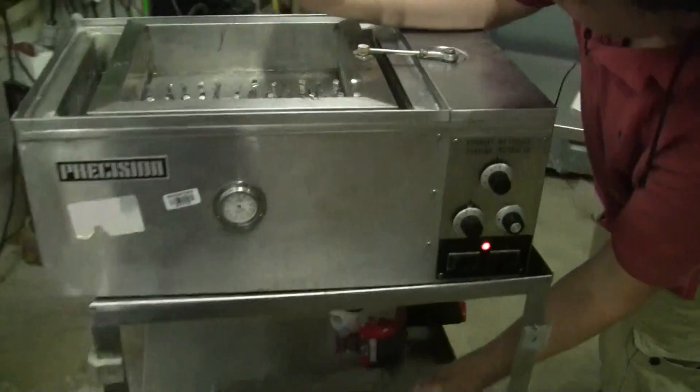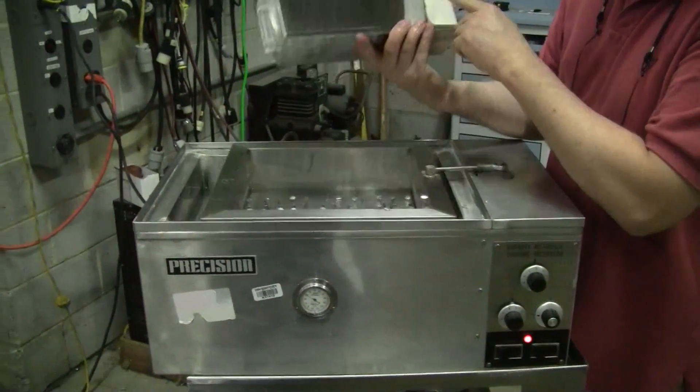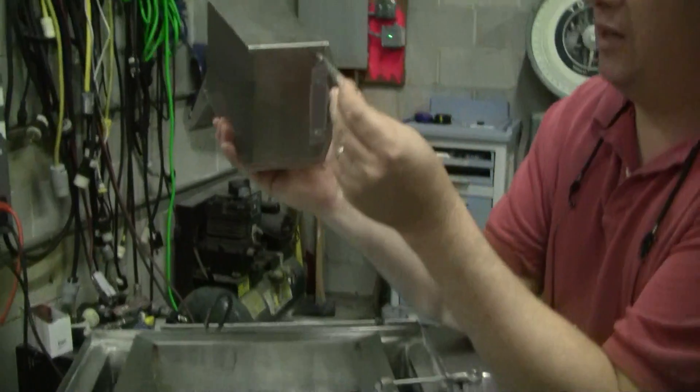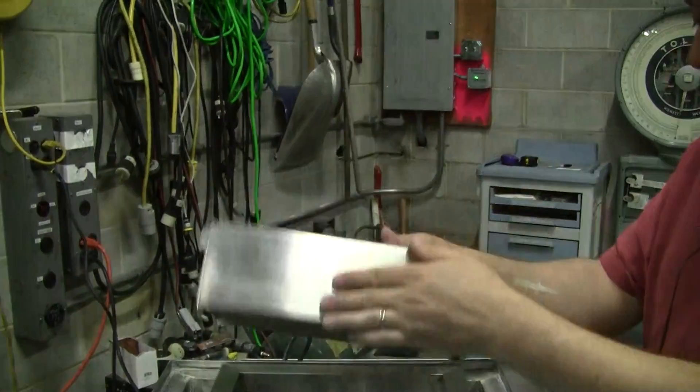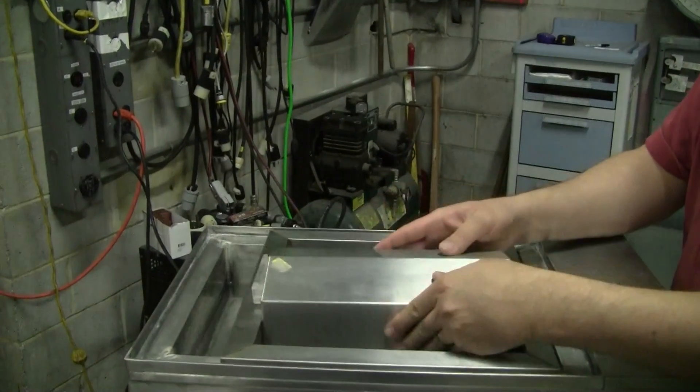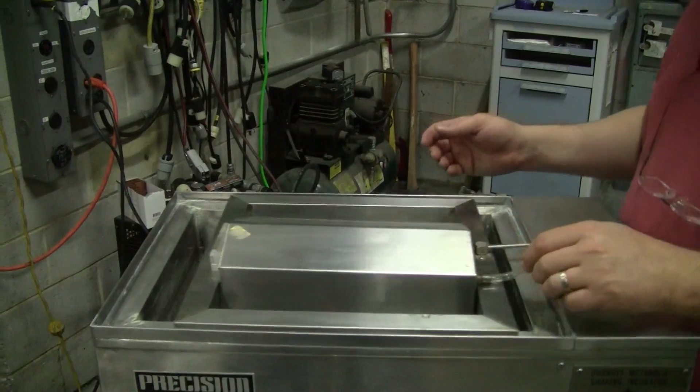Other things that sometimes come with the unit are caps and tops. This one has a little inlet for gas — or it could be for outgassing, where you're trapping your gas and venting it out. It fits right on there and bends right down.